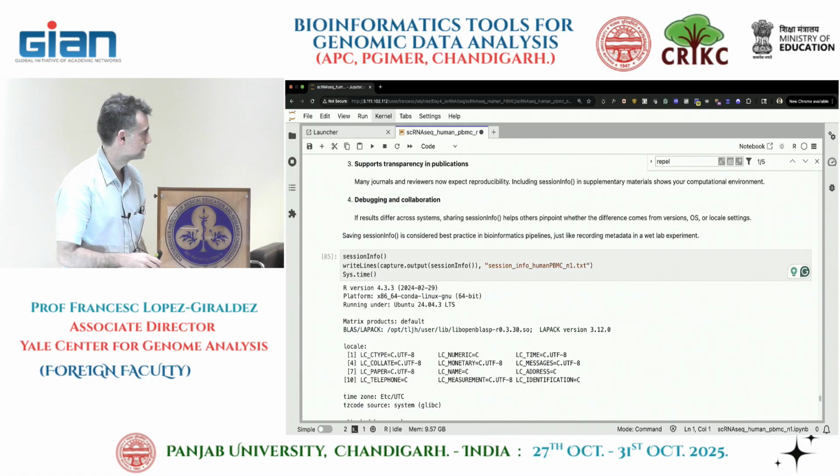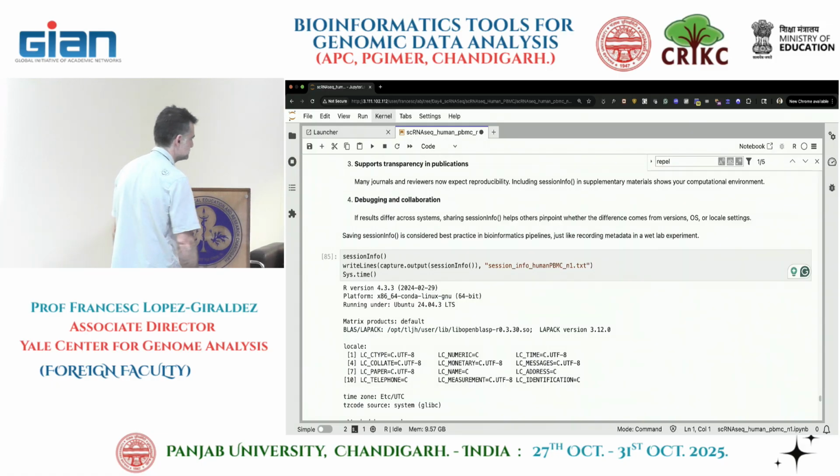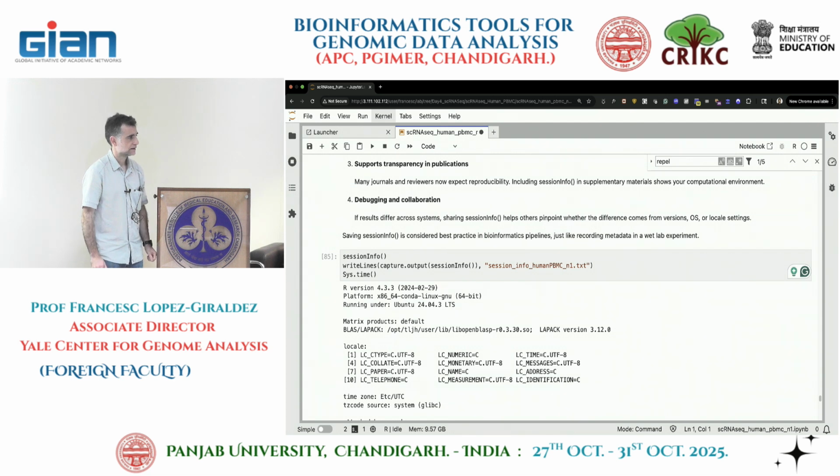I have one question. This is one sample of data, right? Yes. How are the log2 fold changes coming? What are we comparing with what? The genes are giving the log2 fold change. Yes. The log2 fold change we got earlier was comparing every cluster with the rest. So cluster 0 with all the other clusters. That's how we identify what I call cluster-specific genes. They're not 100% specific because sometimes you see them in different clusters, but that's the idea.